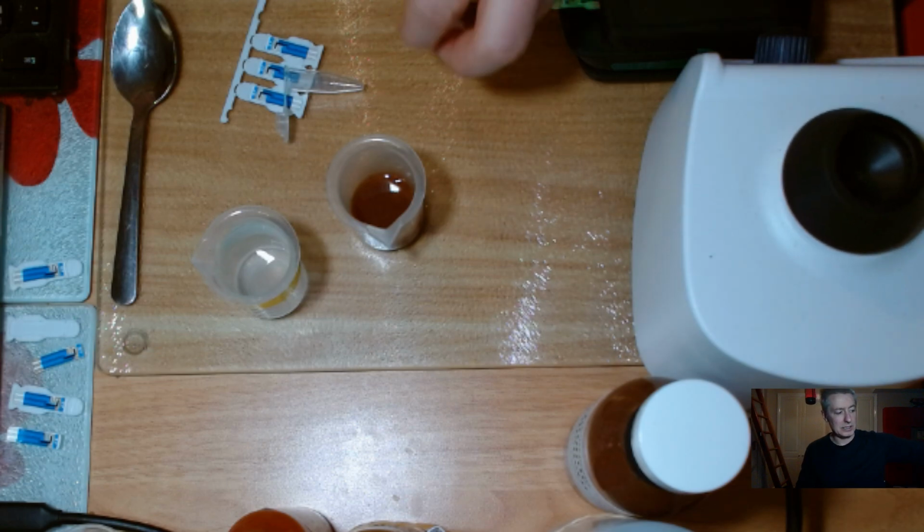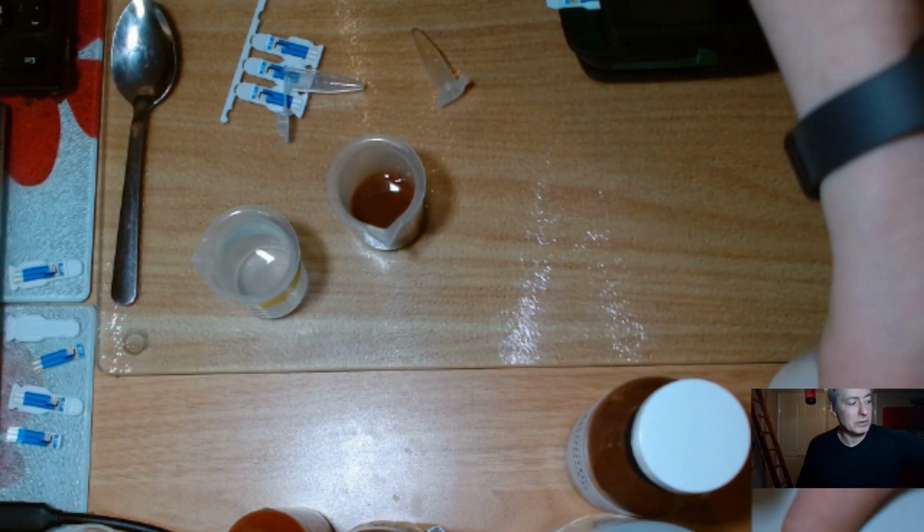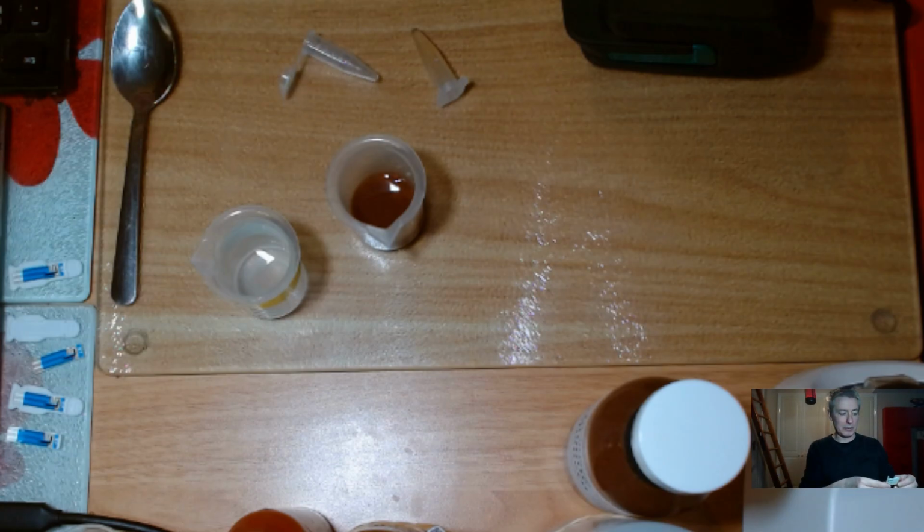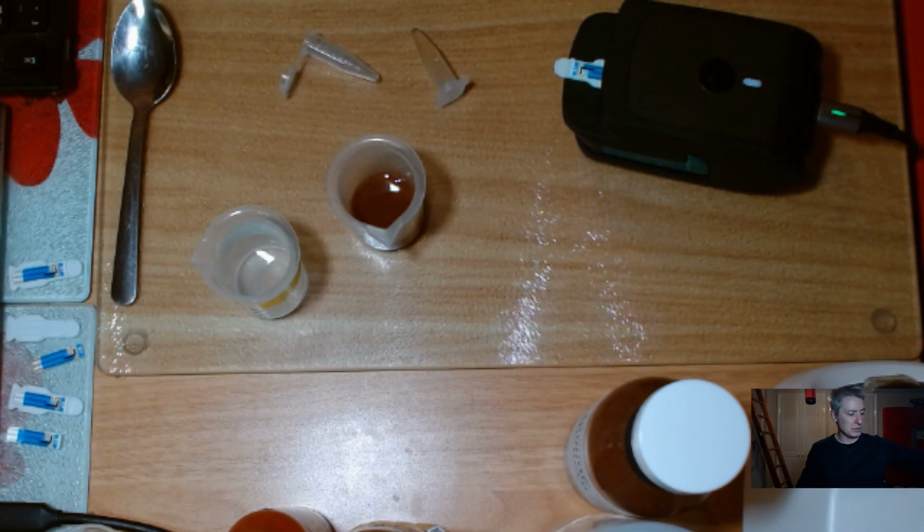It's easier to test these kind of samples because it's mostly liquid phase anyway, so most of the capsaicin is already in the liquid phase, so it's not like trying to test a powder or something that's more solid where we're trying to extract the capsaicin. Here we're just really mixing the material into the buffer rather than trying to extract the capsaicin, because the capsaicin will be already mostly extracted.